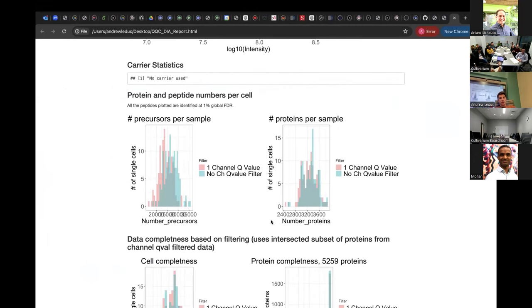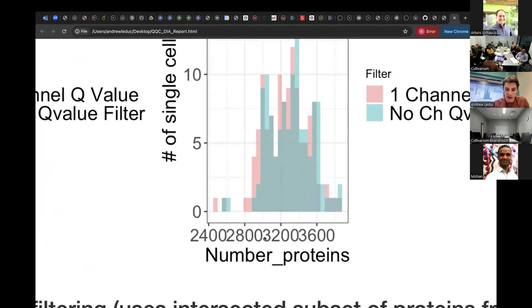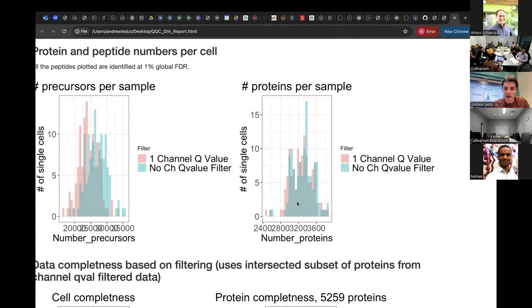And so you can look at things. Some of this is a bit crammed and I need to fix the axis, but I think it's hard to tell because it's all together, but this is like 3,200 proteins. I think the median is maybe somewhere around 3,300 proteins per single cell in this data set that we acquired. These two blue and red distributions are as if you set a stricter channel Q value, say I set mine to one, which is the most lenient.